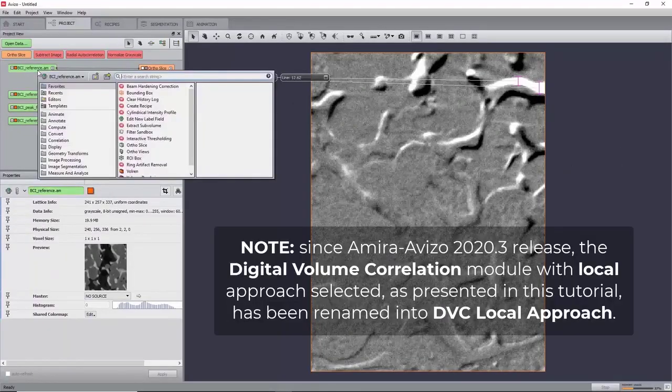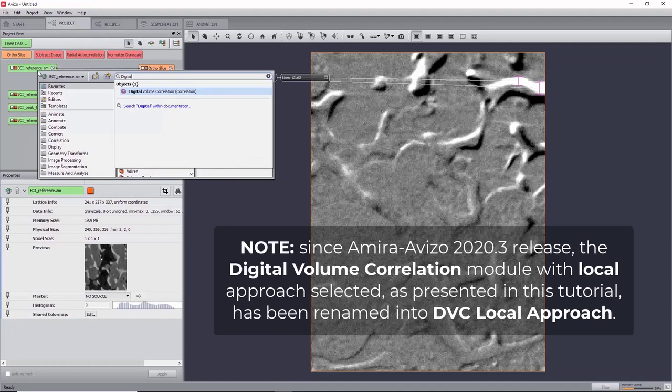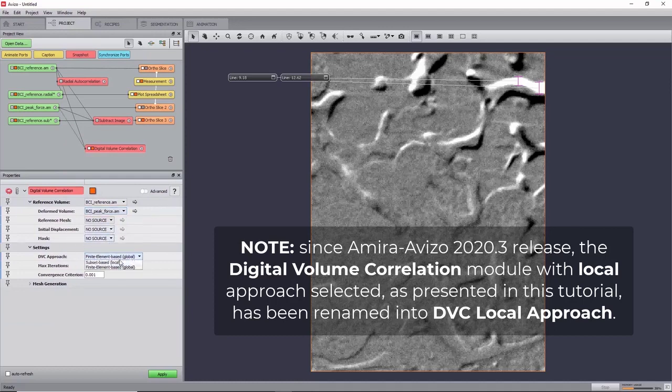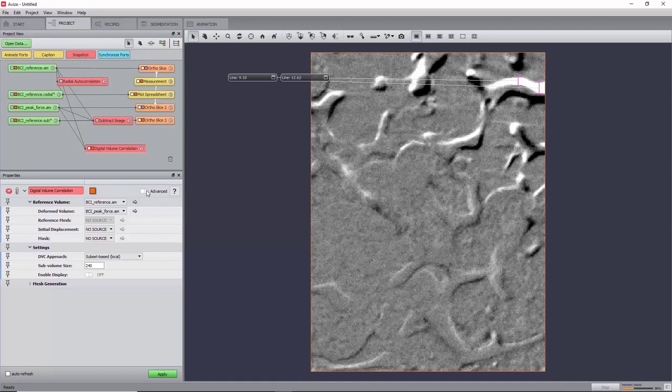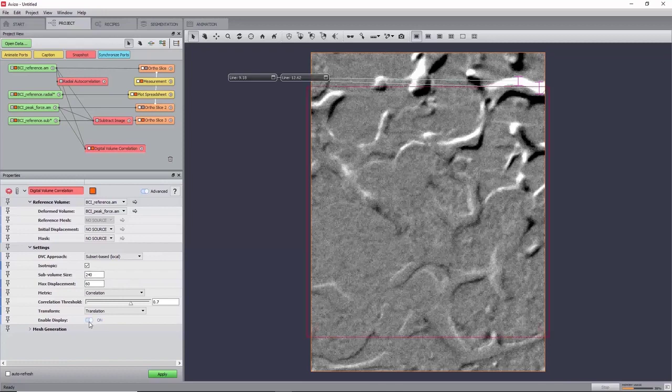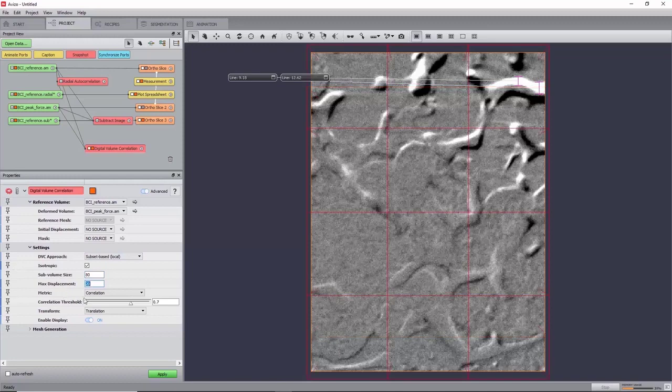You can now attach a digital volume correlation module to the reference image, set the deformed volume port to the deformed image, and the DVC approach to subset-based local. To have access to more options for fine-tuning the algorithm, activate the Advanced Toggle switch, and then set the port Enable Display to On. Using the previous measurement of the characteristic length, we can set the sub-volume size to 80 for initializing, and adjust the maximum displacement to 12 voxels.